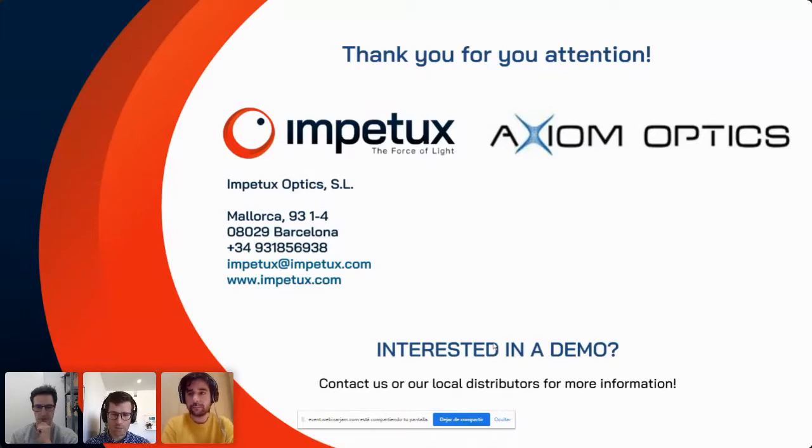Great. Thank you, Arnaud. We had another question from Po. How invasive is this method for single cells? So I think the question is mostly regarding phototoxicity and photodamage you can create, right? Maybe you want to comment on that, Arnaud?